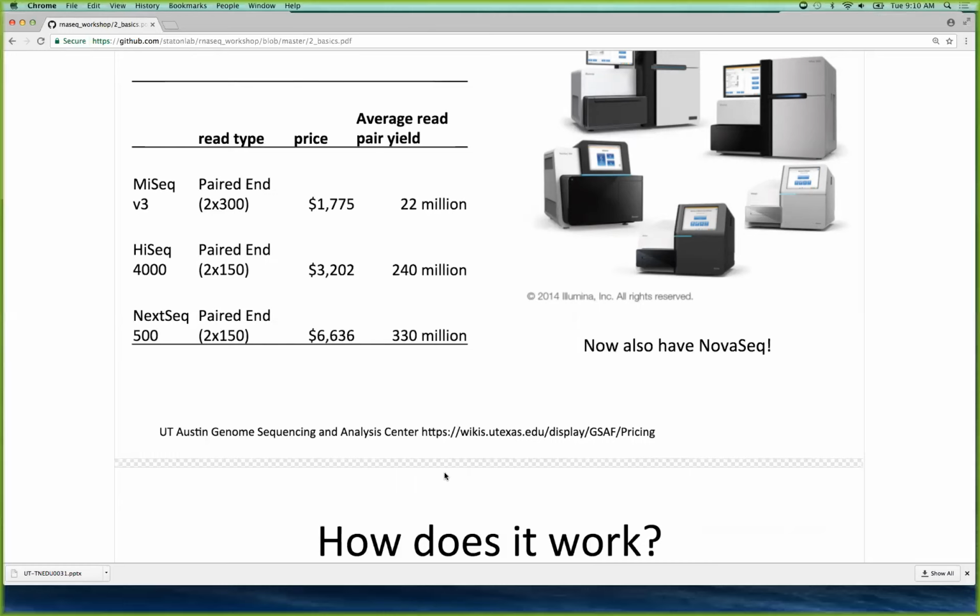Are there 10 million transcripts in a cell? I would guess no, but there's probably a lot. But part of it is sampling your variability, which I'll talk about more tomorrow. So the ENCODE consortium came out with their recommendation of 10 million if you just want highly expressed genes, 100 to 110 million if you want the really lowly expressed genes. Because some things are like 1 in a million, 1 in 2 million, they're very lowly expressed. And if you want to look at differential expression of those, you've got to sequence much deeper. So it kind of depends on what you're looking for.